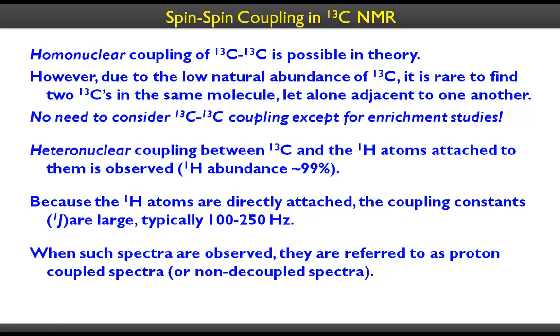If you want to have the coupling, you can have it. If you don't want to have the coupling, you can turn it off. There is something in the instrumentation part which is called a decoupler. You turn the decoupler on, and it nullifies the effect of hydrogens. That's more to do with experimentation. It's a little advanced at your level, but just to explain theoretically, I have some slides here. So either you can collect a coupled spectrum or a decoupled spectrum.